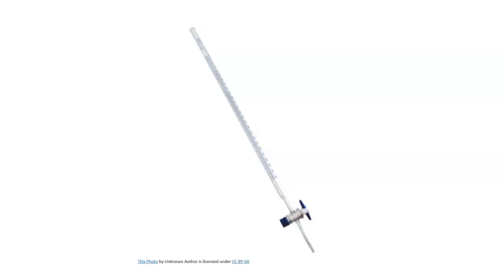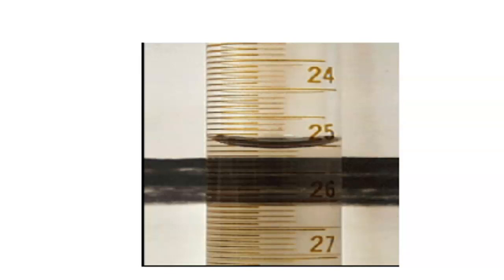Your initial level of titrant doesn't need to be exactly 0. And the reason why is because the initial level is going to end up being subtracted from the final volume to determine how much you actually delivered out of the burette. Now, for any measurements, when we're recording, record the volume of the titrant by reading the bottom of the meniscus, okay? You're always going to refill the burette before each trial to ensure that there's enough titrant to get through all of your trials, okay?